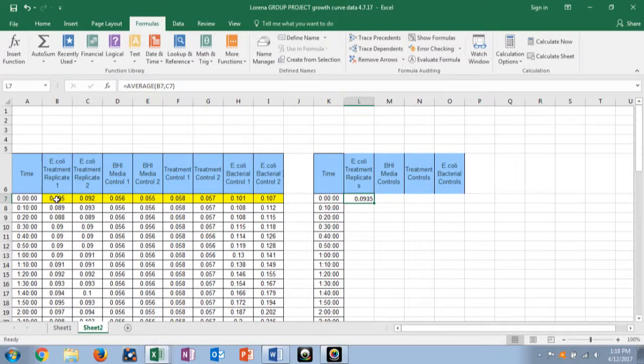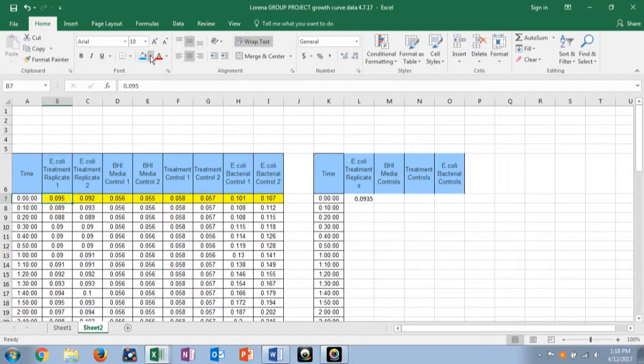So we get this averaged plus this averaged. So we're averaging what I put in green with what I put in purple. These guys are getting averaged right here.